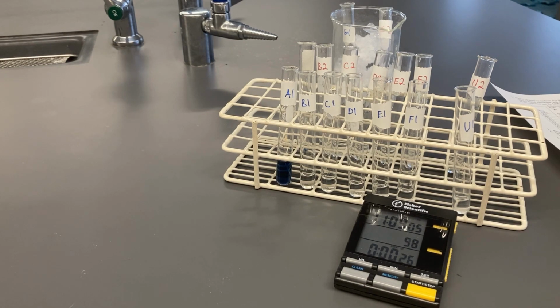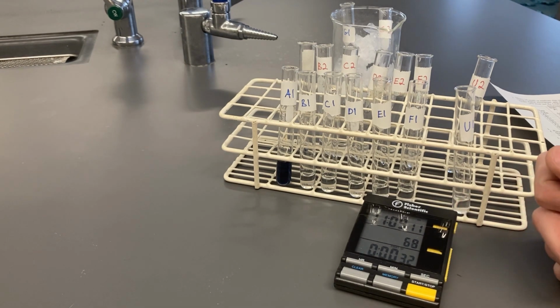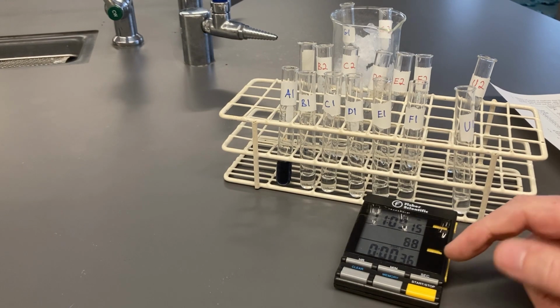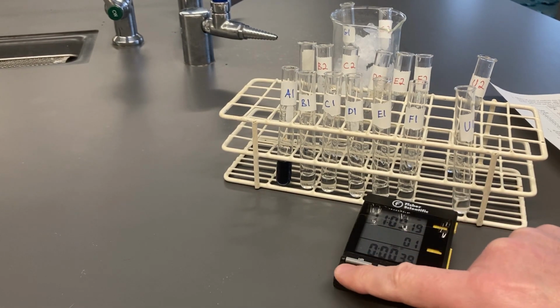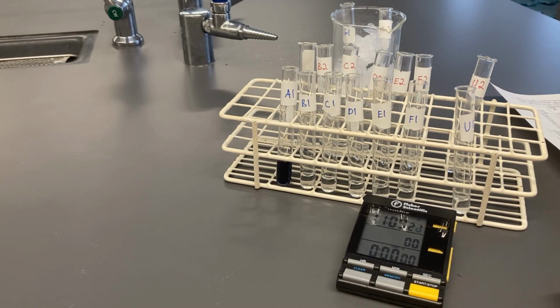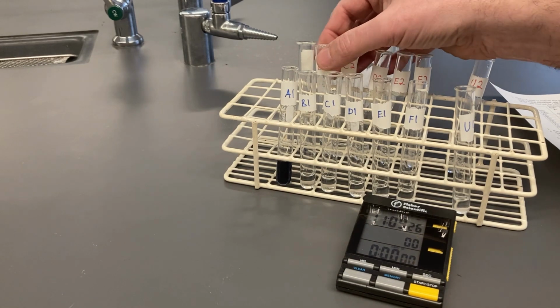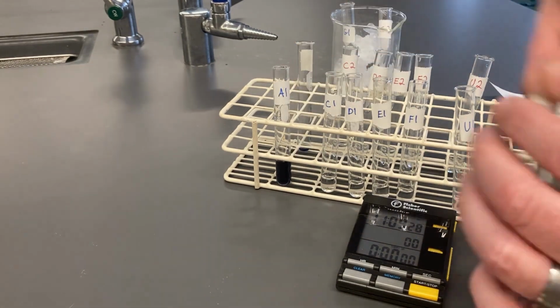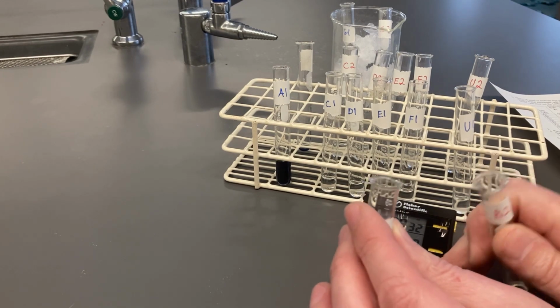And there it goes. So I hope you noted the time on the stopwatch. If not, you can go back in the video and look at it again. So I'm going to stop that and clear it. And I'm going to do the same thing for B1 and B2 here. And I'm going to start them here.